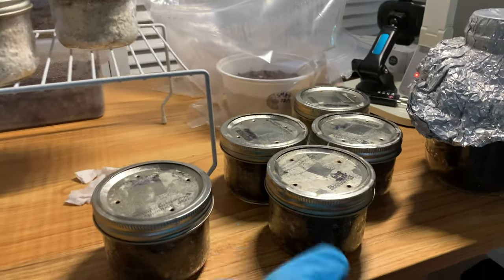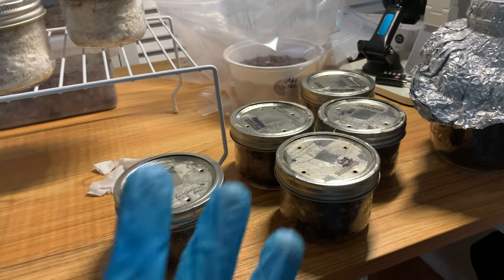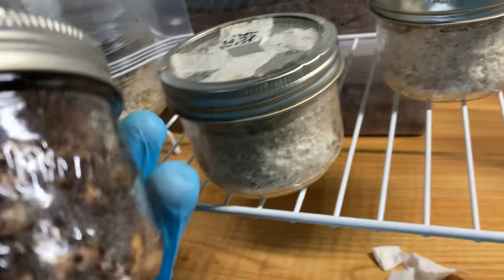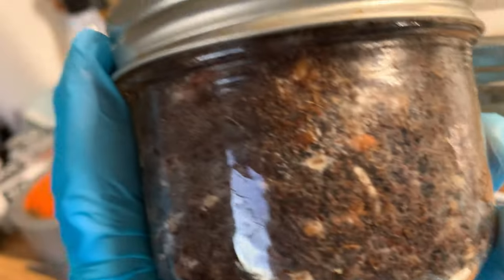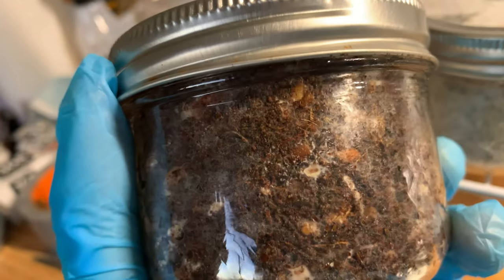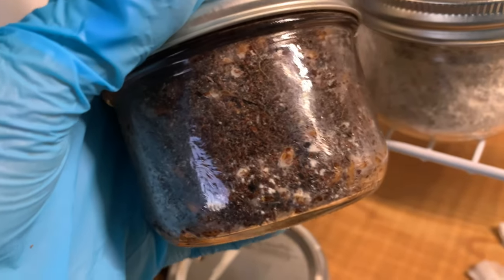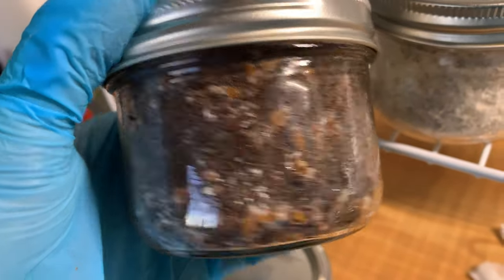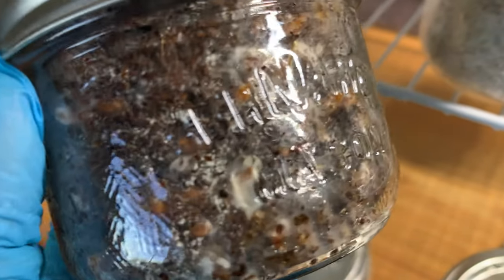I looked at all of the jars — the pasteurized, the partial sterilization, and the actual sterilization jars — and every single one of them has started to develop trike. See that right there? That is trike. Lots of trike. Basically every single one of them has trike. You see those powdery dots? That is trike.